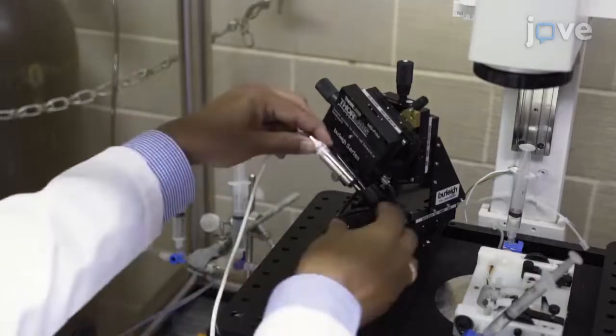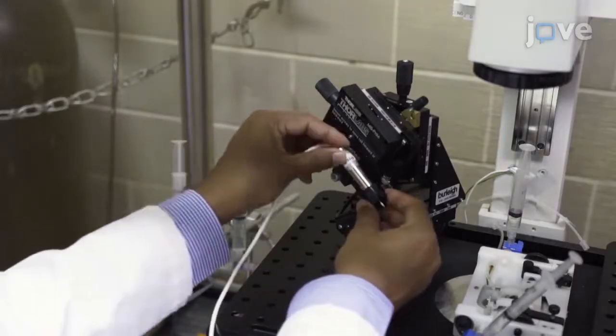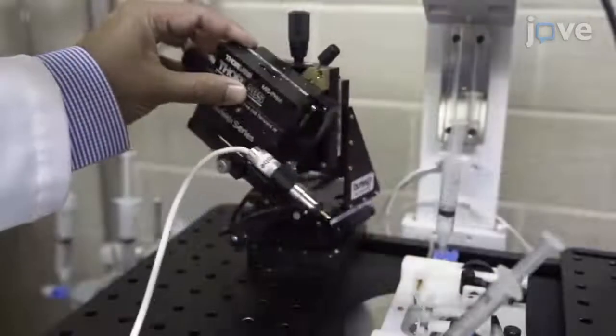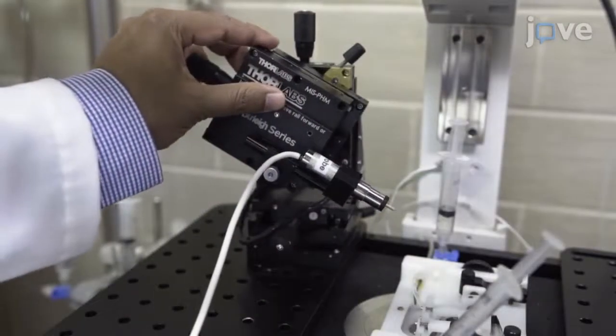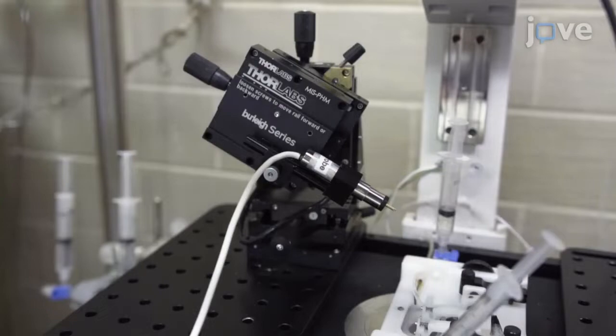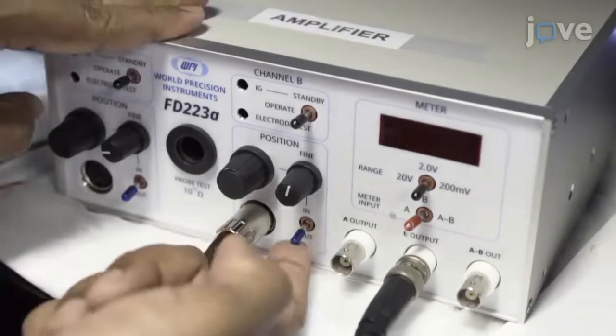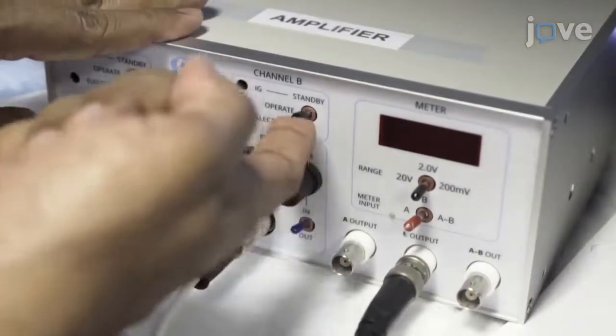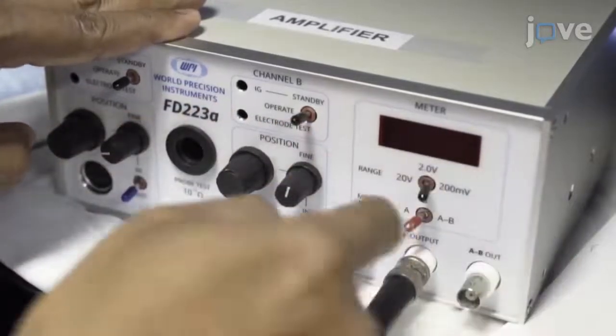Mount the probe in the micromanipulator and turn the micromanipulator towards the microscope and the myograph on a vibration-free table. Place the knobs and switches on the front of the amplifier in the appropriate positions for the experiment as described in the manual.